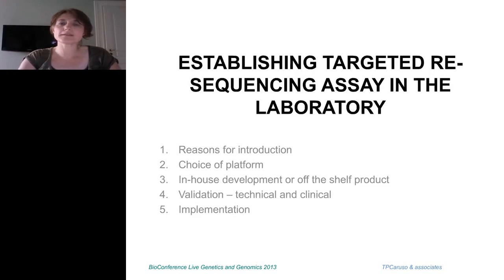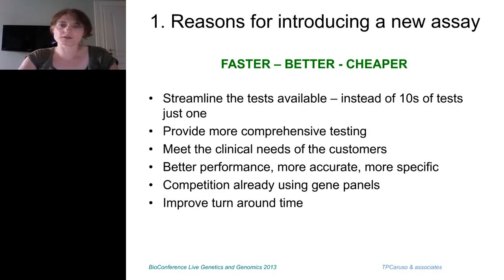Now, when you think about establishing that assay in your lab, it's not really that different to any other assay you've done before. The first thing is, why do you want to change? Why do you need it? What platform to use, and a few other things. So I'll talk in that kind of order here.